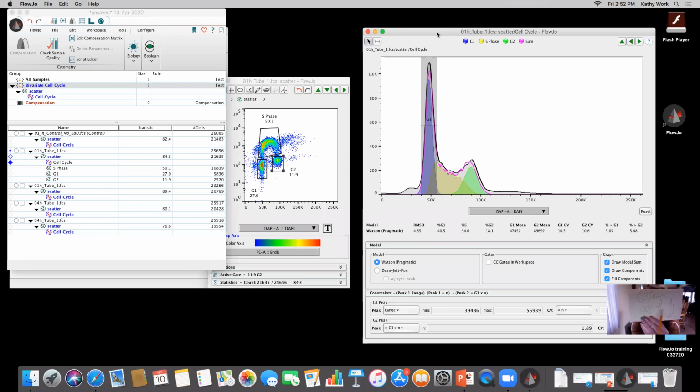And if it's backwards, I apologize. And these 2 right here, which have half the amount, are a count of 2, right? And that's going to show up a little bit lower in intensity because each of those individual cells has half the amount of fluorescence as that original. So it's doubled in number, but it's half the amount of fluorochrome in each cell because of the division of the cell. I hope that clarifies it for you. If it doesn't, I'll try again.